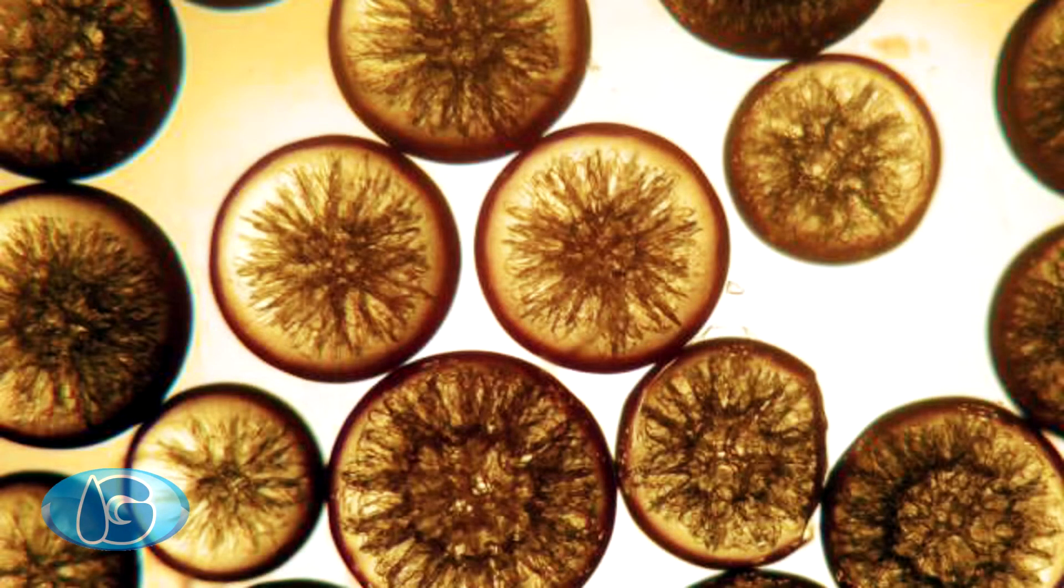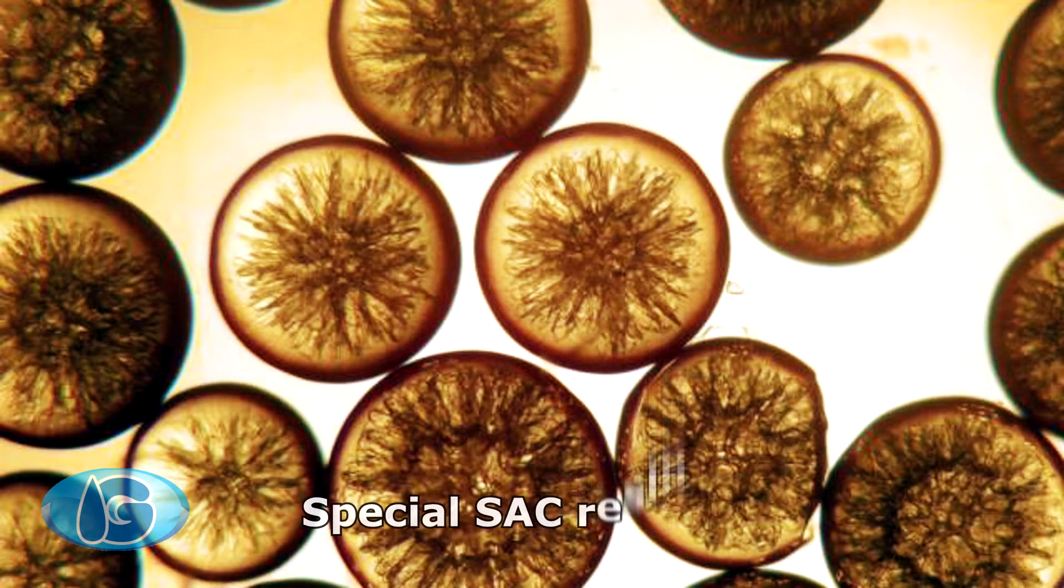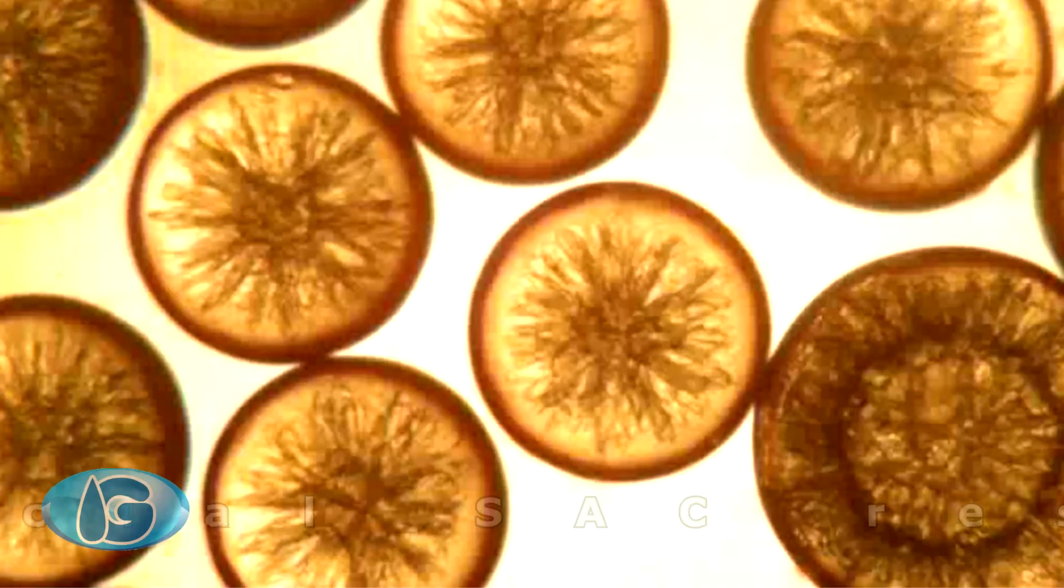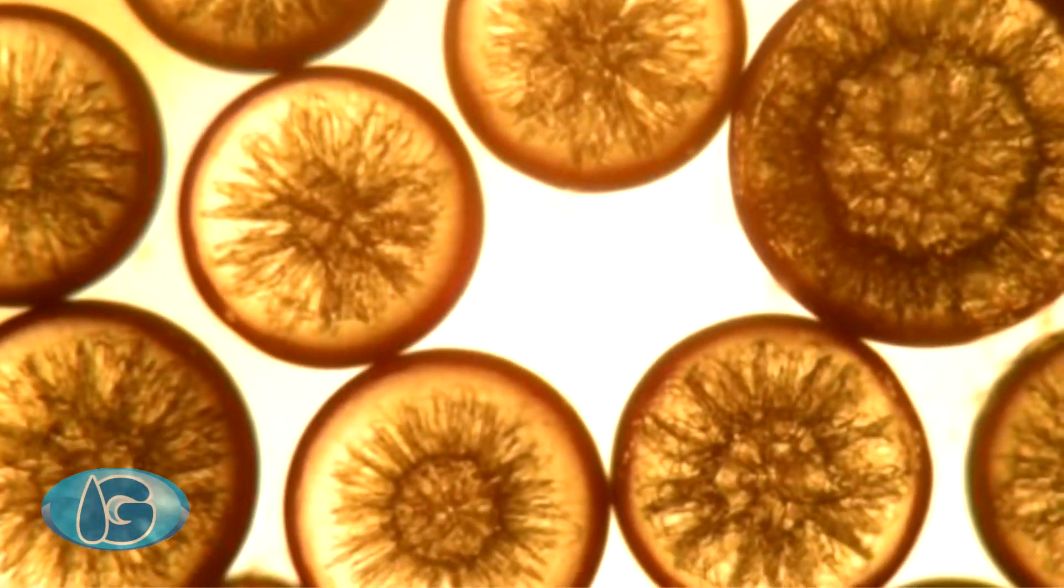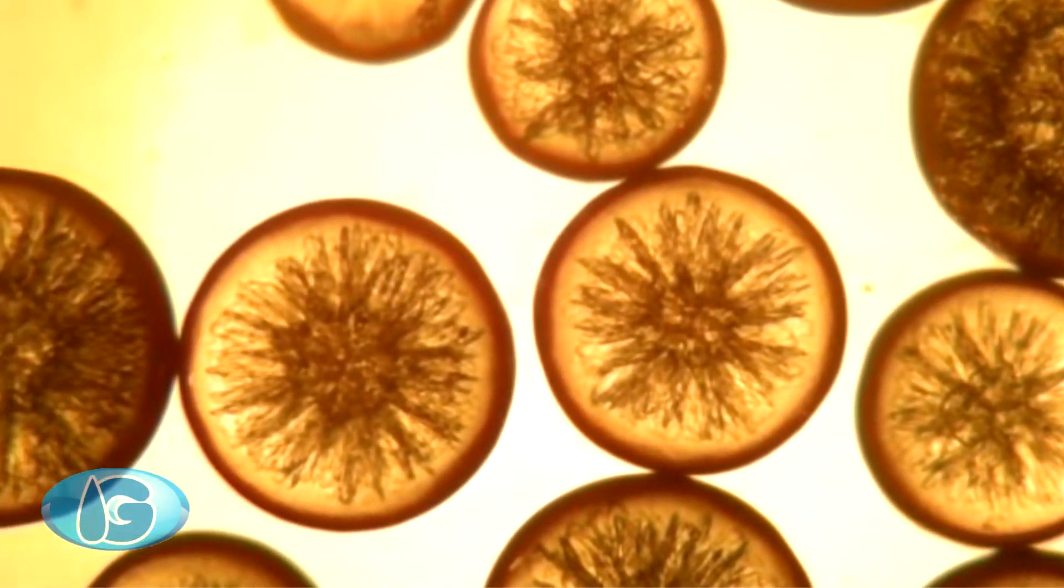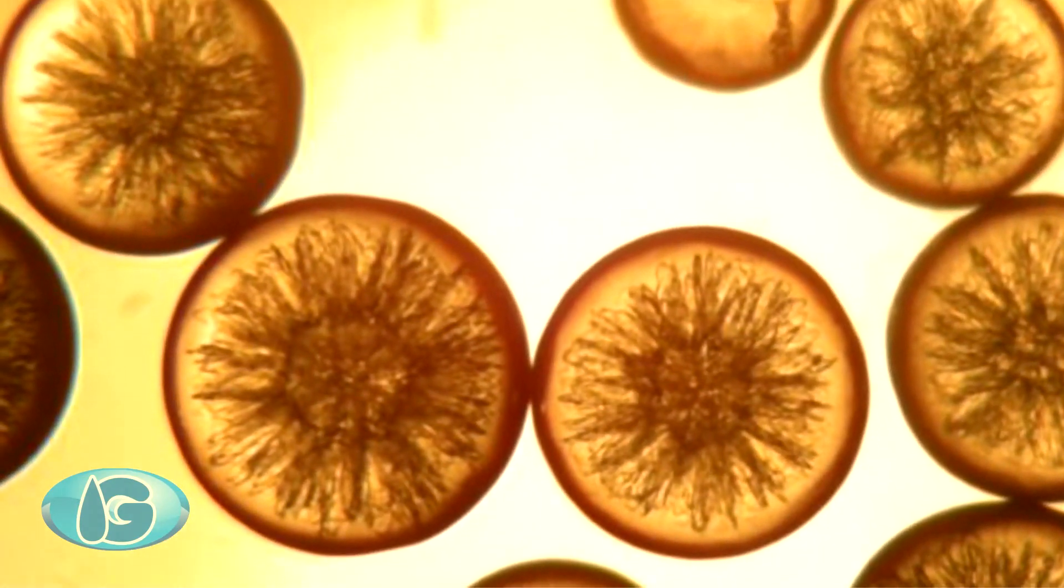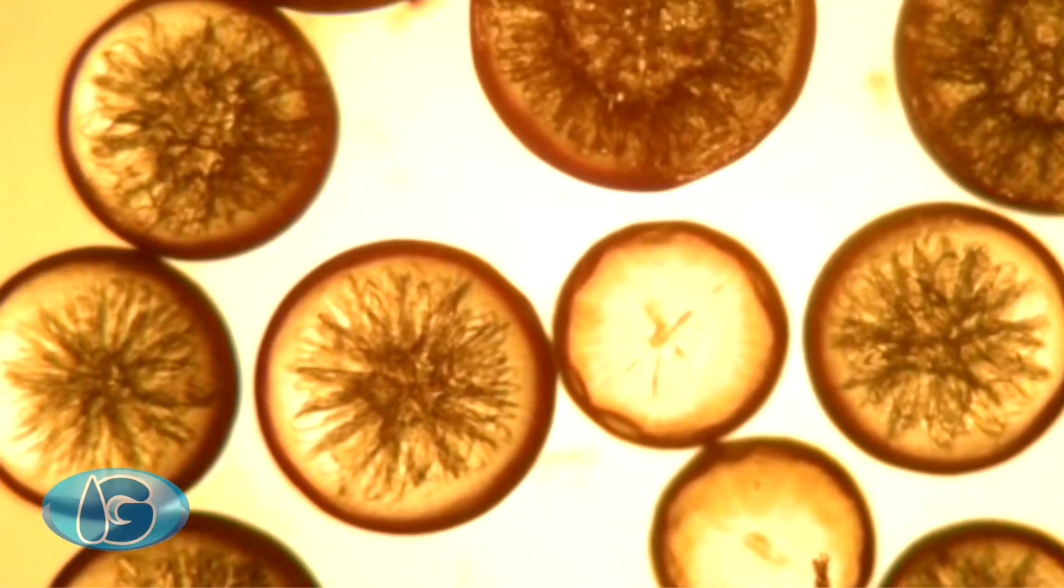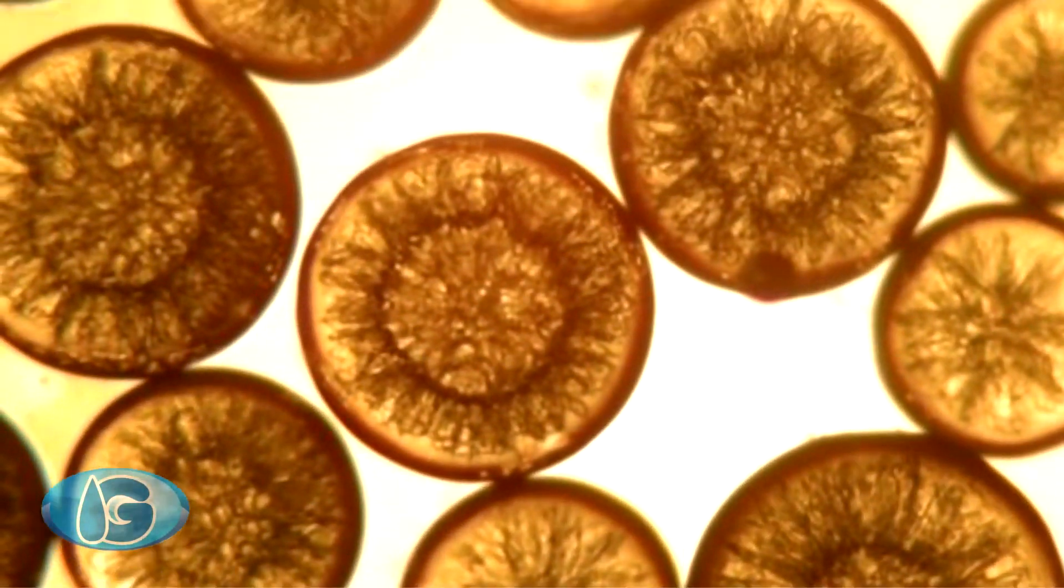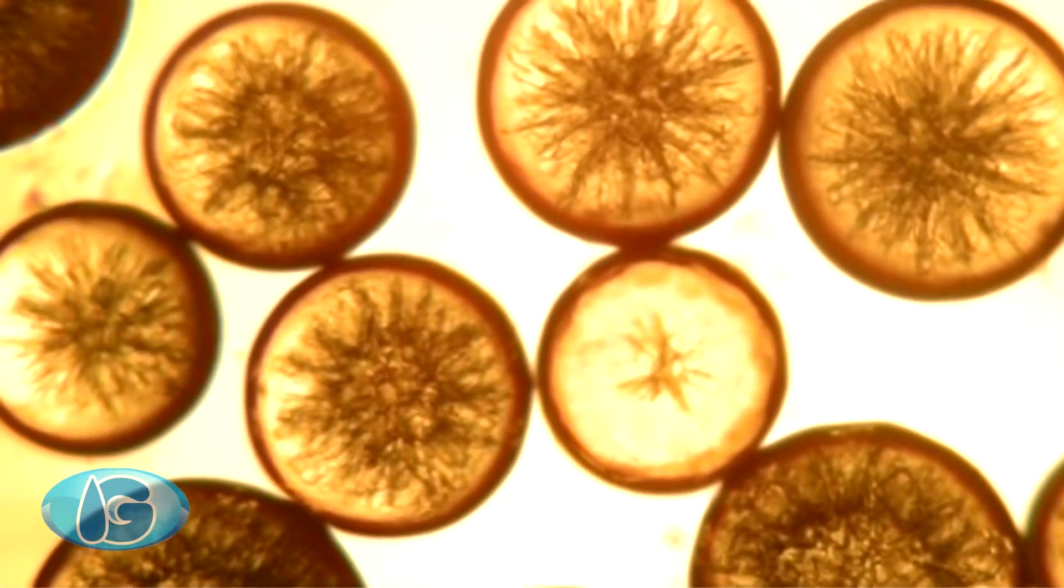This another type is not a uniform resin, but is a special type because a manufacturer promises this resin removes iron and manganese in large amounts in water. Remember, to remove iron and manganese from water is not recommended softening. It is better oxidation and filtration. Metals in water can bridge and clog the resins. Because of that, softening is not recommended for remove metals. Anyway, you can use resins for that, but be careful.